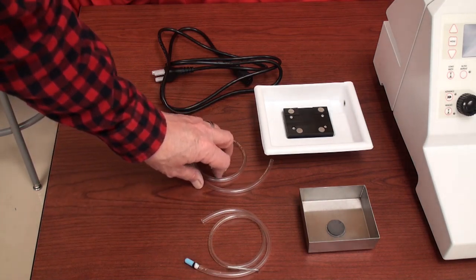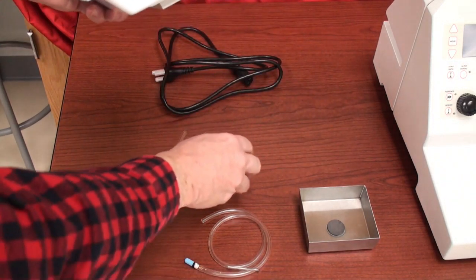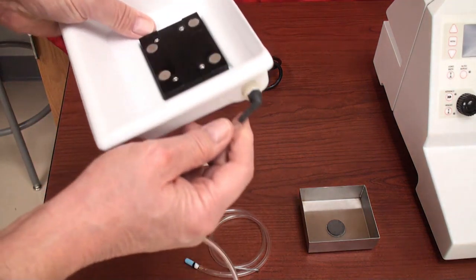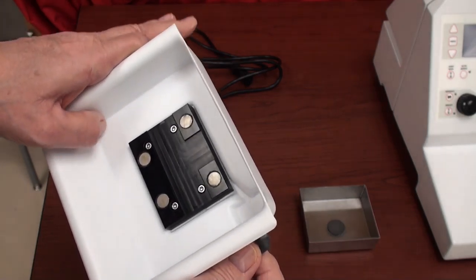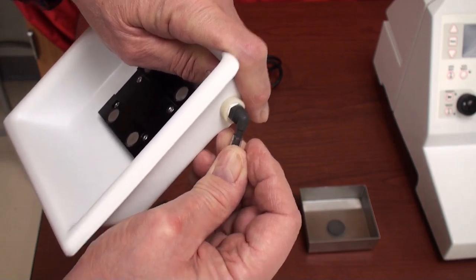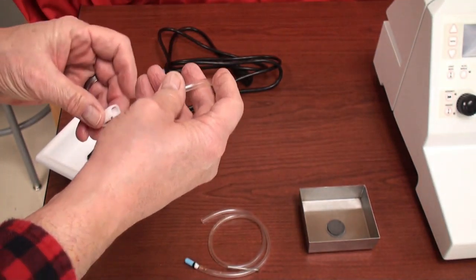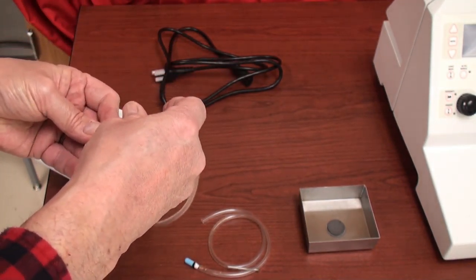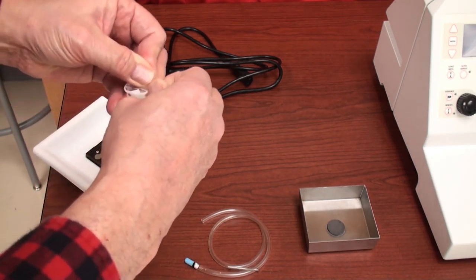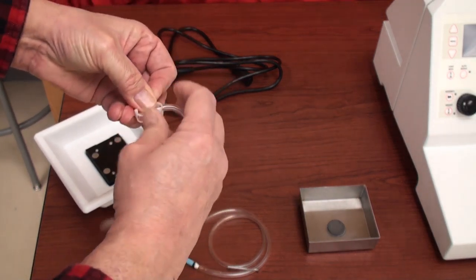This is a drain line and clamp which attaches to the outlet of the ice bath that comes with the unit. This is all part of the sample holder assembly. You simply slip the hose on the fitting and then slip the hose through so it protrudes out the bottom.